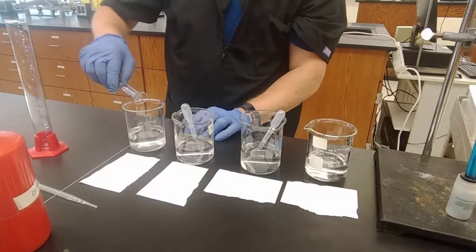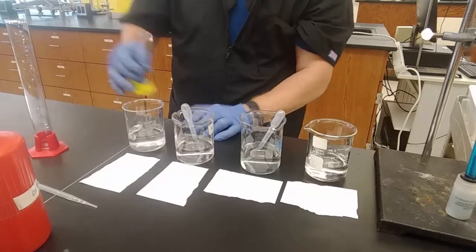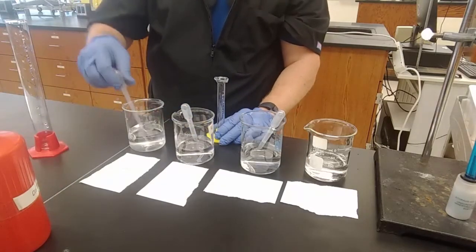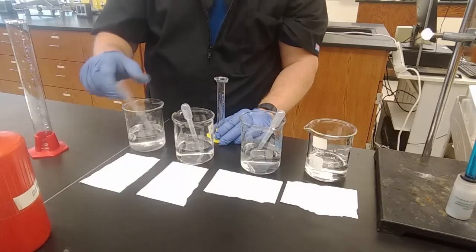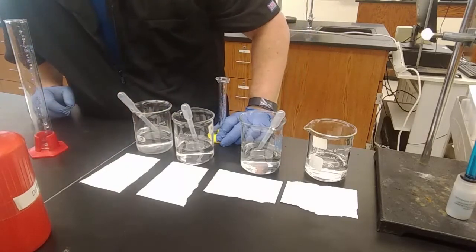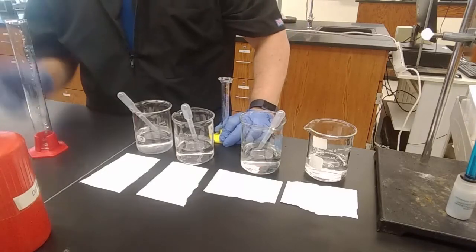10 milliliters of 3, 90 milliliters of water into 4, and this was my deionized water pipette. Stir well. All right, so that's a 4. Step 5.